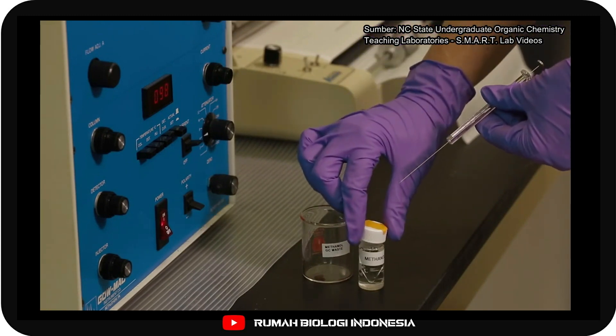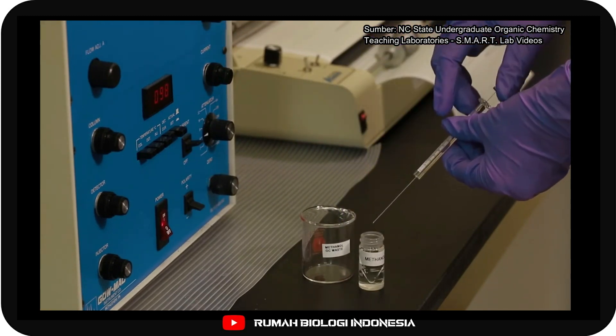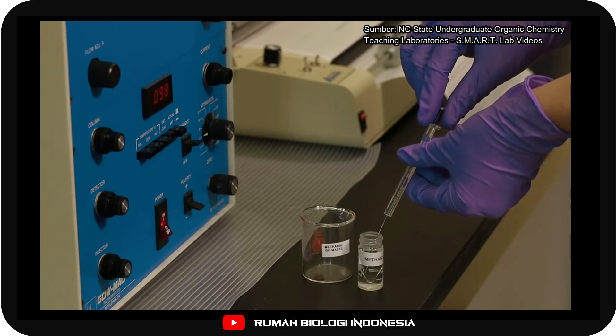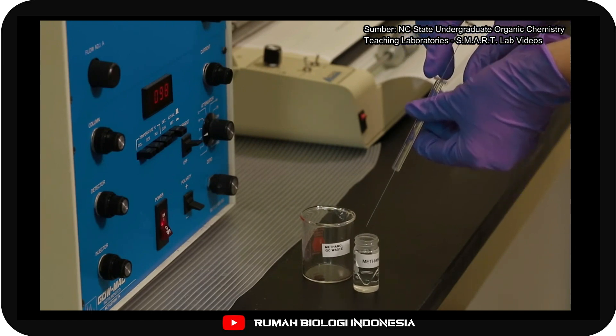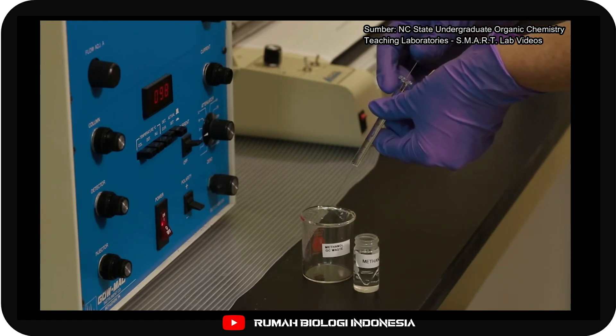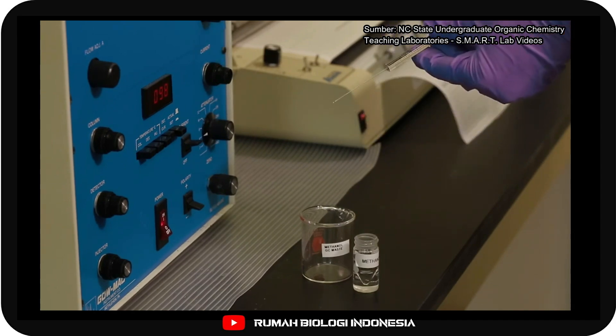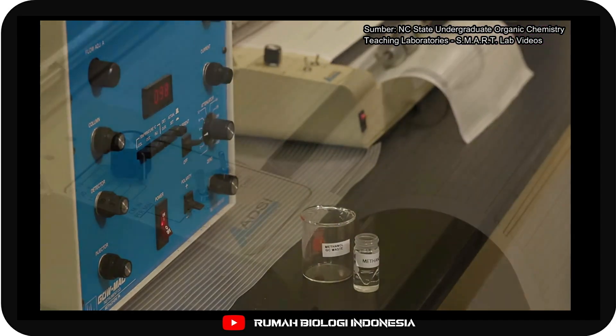While the sample runs through the column, clean the syringe that you used to inject your sample. Pull a solvent, such as methanol, into the syringe. Then empty it into a waste container to clean it of any remaining sample.